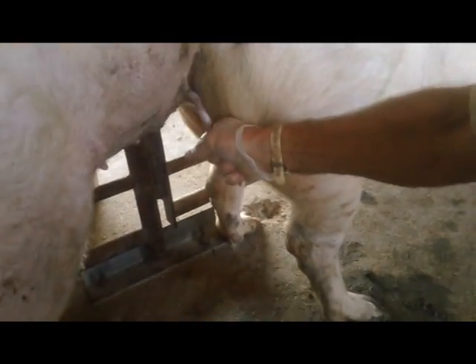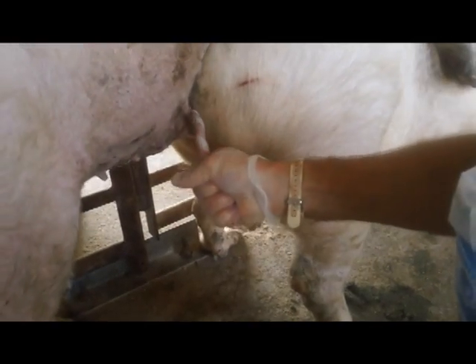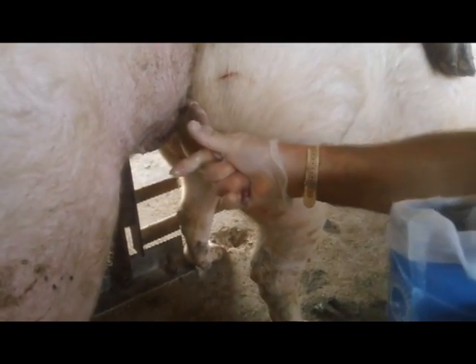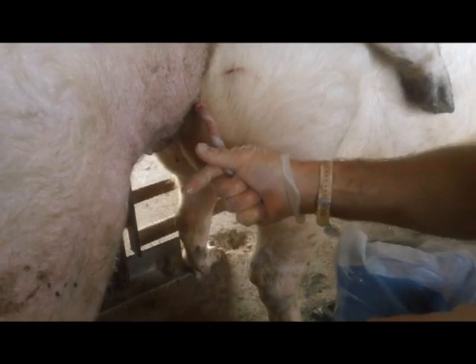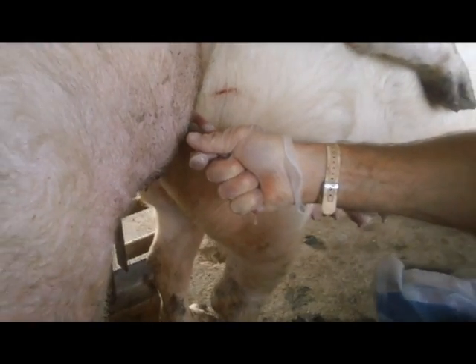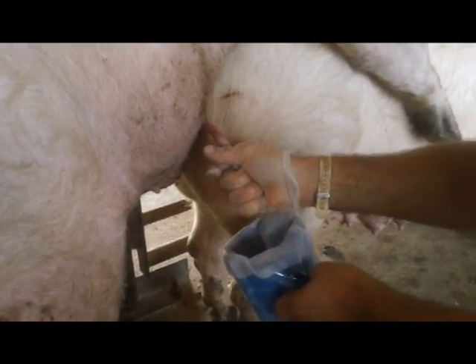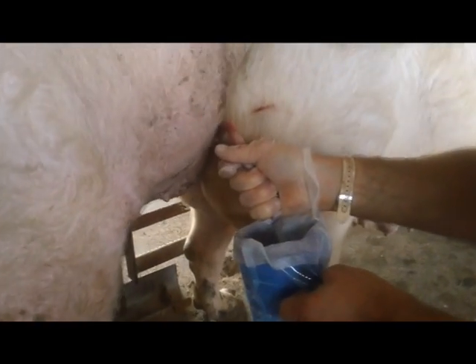Once we have the glans penis gripped correctly, we need to continue applying the pressure needed for the boar to achieve a full erection and begin ejaculation. Our job is to maintain this grip and give the boar freedom of movement to do the rest. Remember to not collect the colorless pre-sperm fraction — wait for the semen to change appearance to the more characteristic white sperm-rich fraction before beginning collection. Producers collecting a boar after mounting a sow must be prepared to move with the pigs as the sow shifts position.